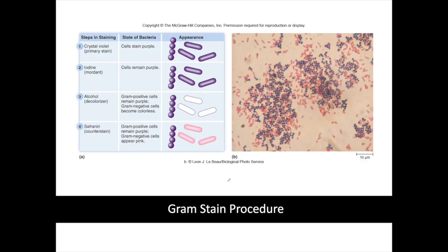So this is the gram stain here, the gram staining procedure. I'm not going to go through it in great detail because in our next lecture in cell morphology we will, but I just want to show you the differential aspect of it. So in gram staining we have two different types of bacteria that are here together on the same slide. If a cell is gram positive, I'll find one here, then it is going to be purple. If a cell is gram negative, then it's going to be red. And the reason for this is we apply what we call our primary stain first, and that causes all the cells to be purple. We will apply some kind of mordant that will cause the purple dye, the crystal violet, to adhere to one cell type but not the other.